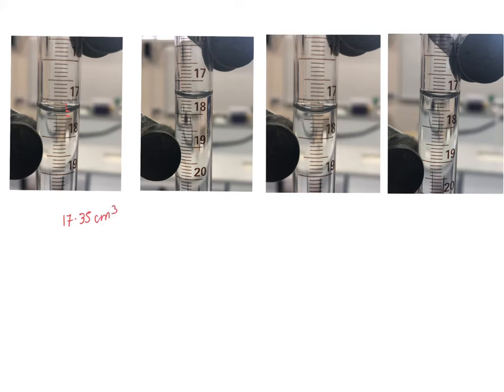If we look at this burette, the meniscus is exactly on that level there, and that level there is 17.0, 17.1, 17.2, 17.3, 17.4, 17.5. Now, because we can read a burette to 0.05 centimeters cubed, it's not sufficient to say it's 17.5 centimeters cubed. We have to say it's 17.50 centimeters cubed to show that it's not between 17.5 and 17.6, or 17.4 and 17.5, and we've rounded up. So you need to go to the second decimal place, to the nearest 0.05 centimeters cubed.